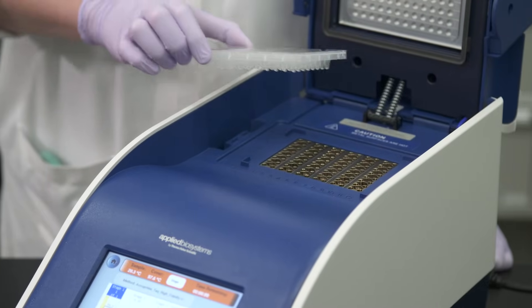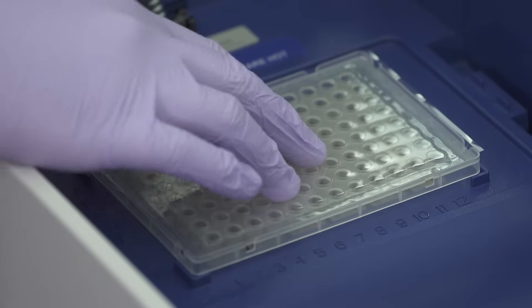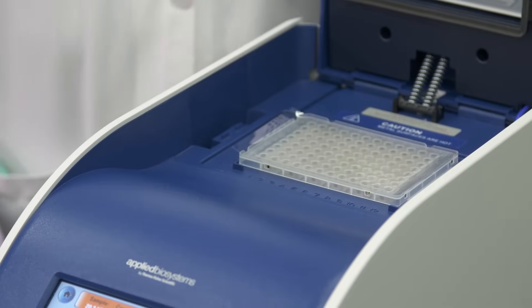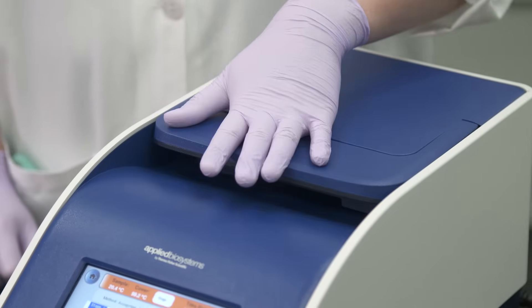A fast or low profile PCR plate is the plate of choice for an instrument with a fast or low profile block type such as the Applied Biosystems Veriti 96 well fast thermal cycler.